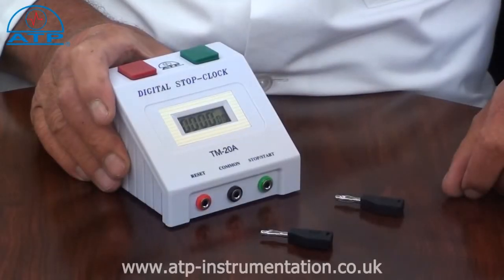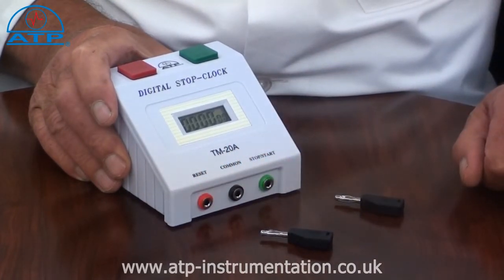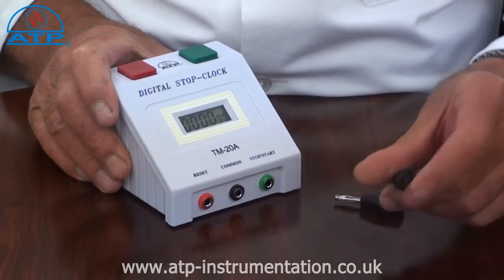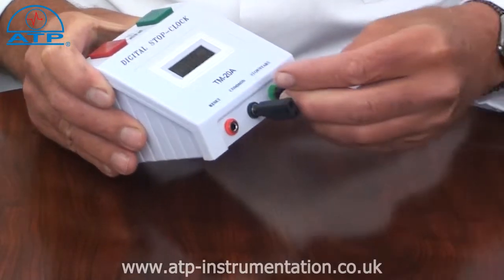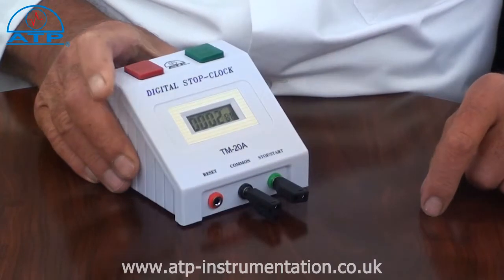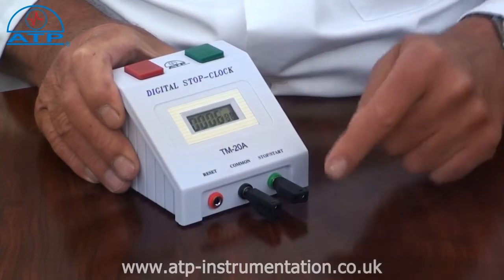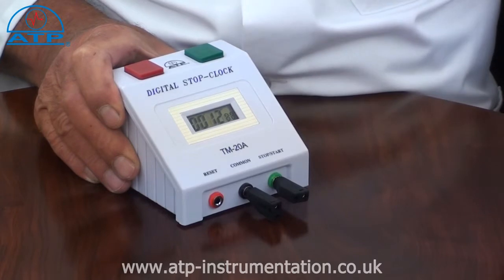The stop clock has three 4mm jacks which allow the timer to be integrated into an experiment or process. 4mm jack plugs can have wires connected. As long as the process has an action that completes the circuit, the stop clock can be started and stopped by the action of the process.